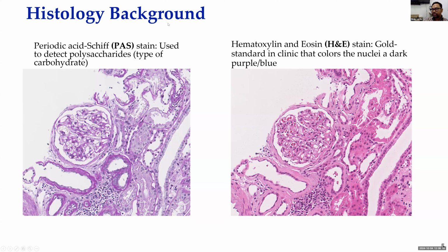So histology is nothing but a way of staining thin tissue samples, which are used for examining the basics in tissue samples, or having a better understanding of what is going on in a tissue sample. So histology is nothing but staining that tissue with chemical agents.